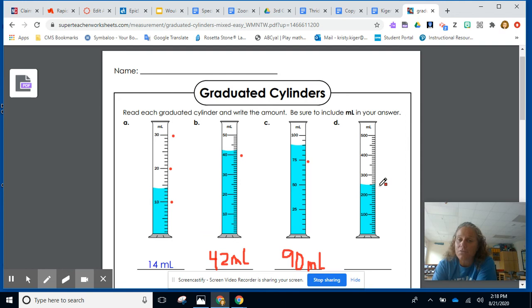Whoa, look at this one. It's got big numbers. 100, 200. This is counting by hundreds. So these obviously aren't going to count by ones. They're not going to count by fives. Oh my goodness. Look at, let's try tens. 10, 20, 30, 40, 50 is right in the middle. 60, 70, 80, 90, 100. So all of these little lines are actually counting by tens. So I come up here. I'm going to guess that this is 250 because it's right in the middle, but I want to make sure I get it right. So if I'm at 200, 210, 220, 230, 240, it is, it's right at 250 milliliters. All right. So I'm going to put this here.